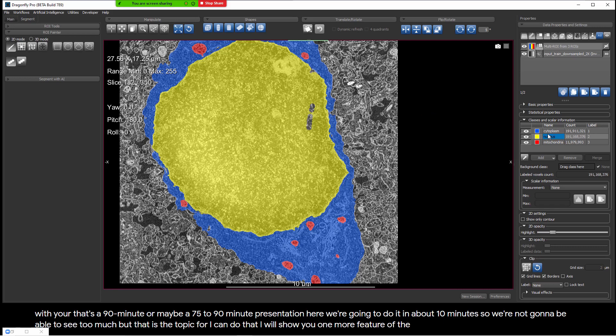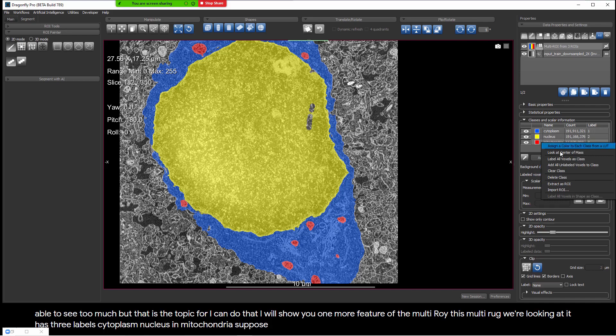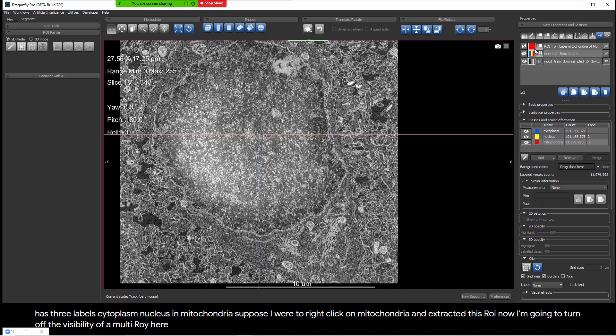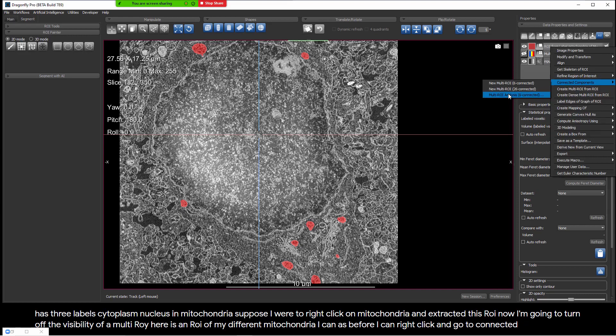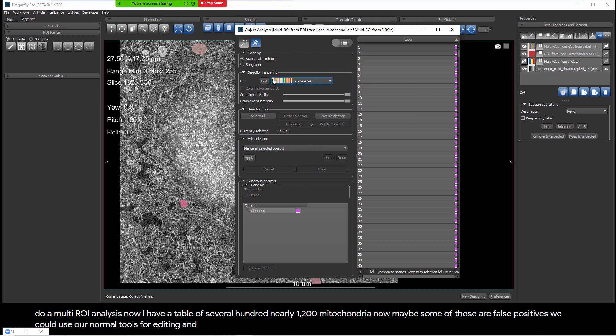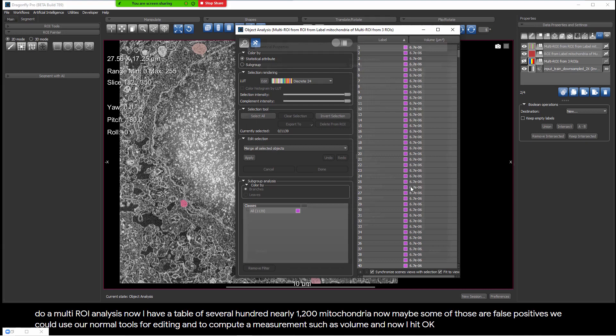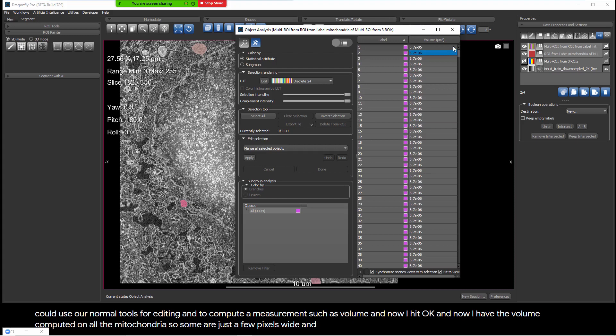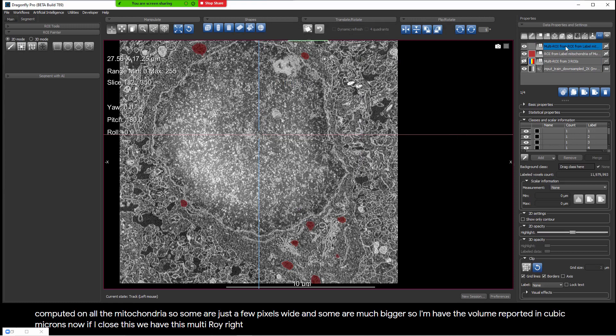Before getting into that, let me show you one more feature of the MultiROI. This MultiROI has three labels: cytoplasm, nucleus, and mitochondria. Suppose I right-click on the mitochondria and extract this ROI. Turning off the visibility of my MultiROI, here is an ROI of my different mitochondria. I can right-click and go to Connected Components and do a MultiROI analysis. Now I have a table of nearly 1,200 mitochondria. Some of those may be false positives. I'll compute a measurement such as volume — I hit OK and now I have the volume computed on all the mitochondria, reported in cubic microns.